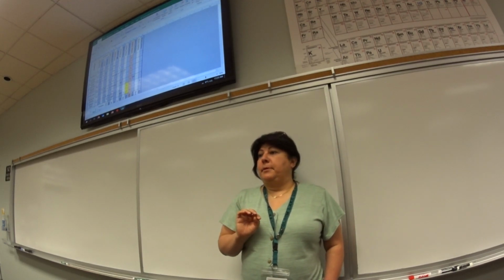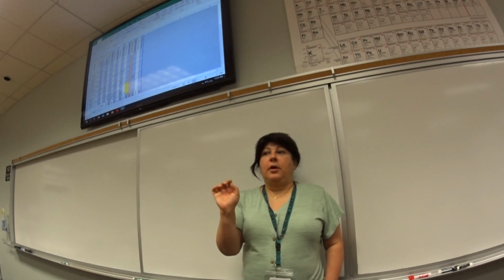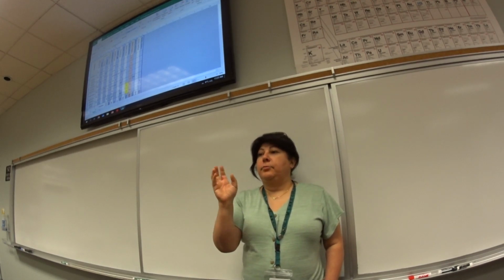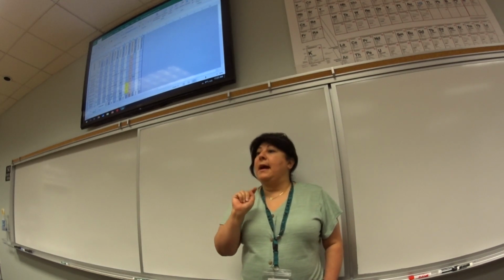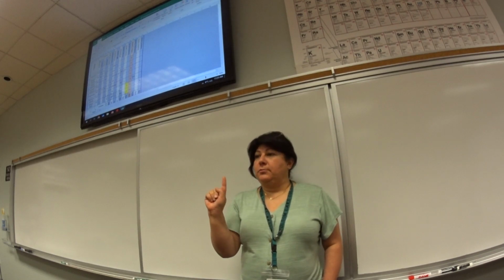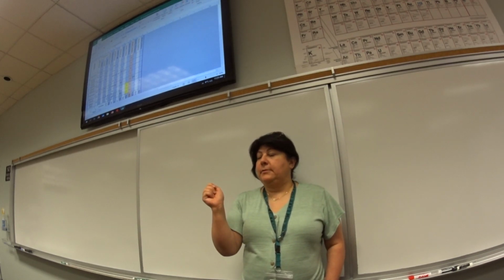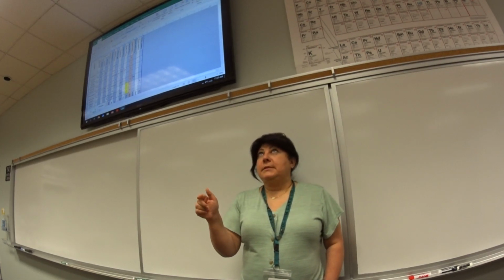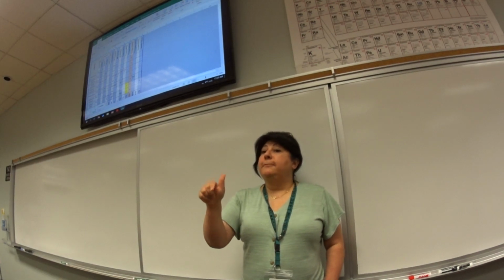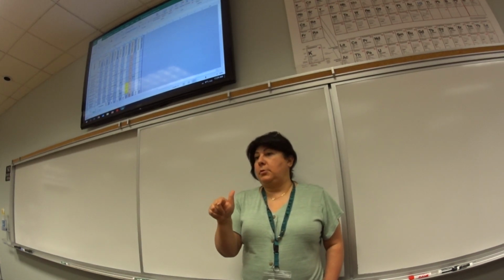By the way, I pretty much write down next to the numbers, based on what Kim tells me, whether it's gram-positive rod, gram-negative rod, gram-positive cocci, and so on. So that I know. The rest I don't know. I give them out blind, all right? My colleagues tell me I'm insane, but I will confirm for you whether your gram staining result is correct.